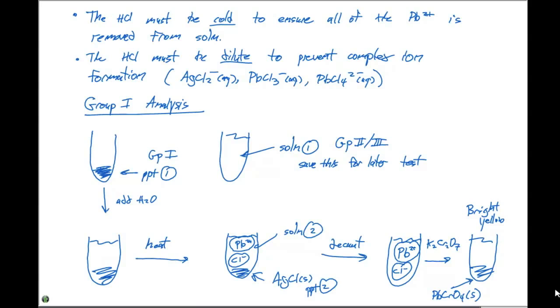Okay? But the thing that we emphasize here, and the reason I point this out, is when I say school bus yellow, most students know what that means. So in the identify step, we want vivid colors. Or we want colors that are not easy to miss. Because students get very frustrated if they lose 6 points because they didn't properly identify if a particular ion was in solution.